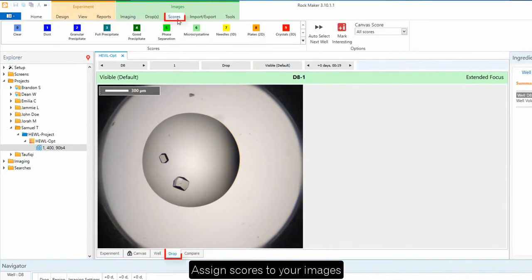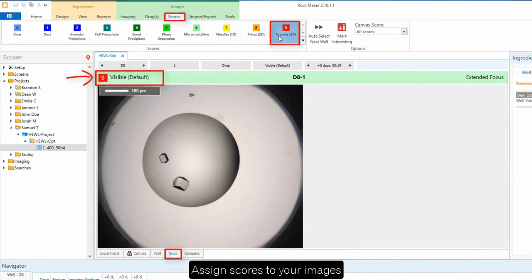Scoring images is quick and easy in RockMaker. You can assign scores to your images from the menu or by using hotkeys that you can set yourself.